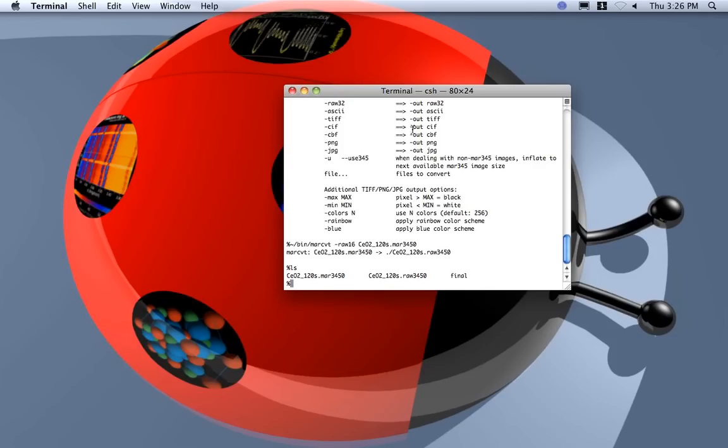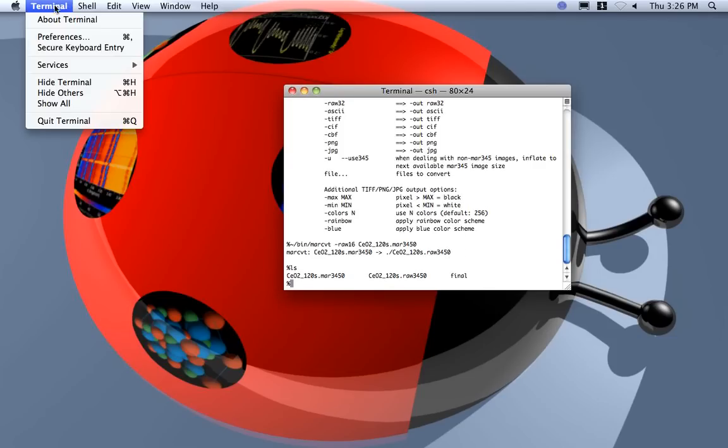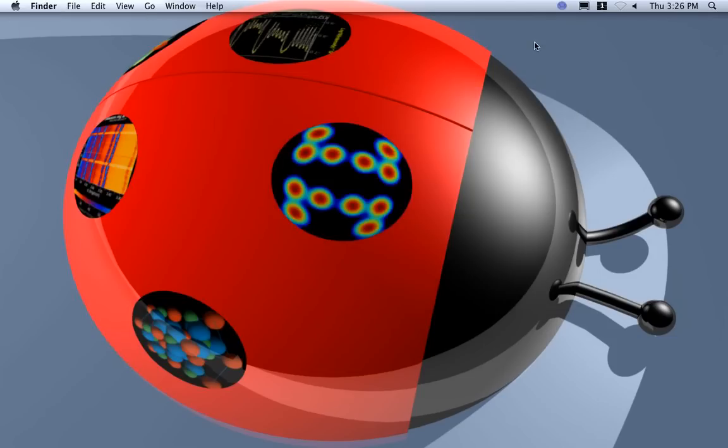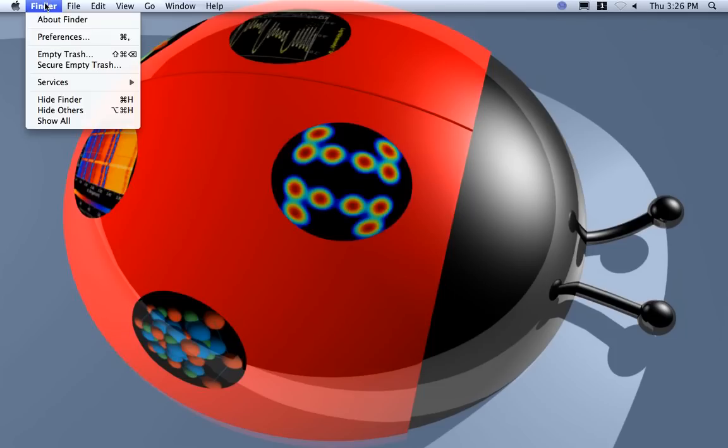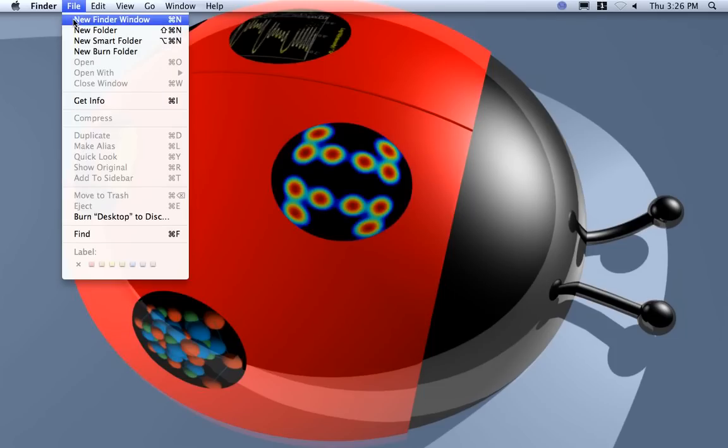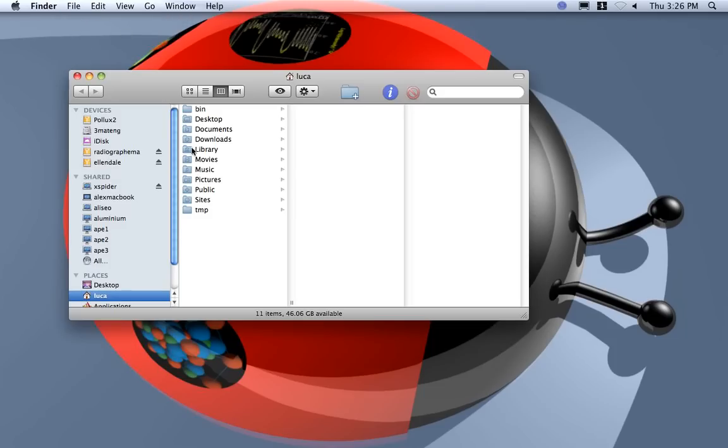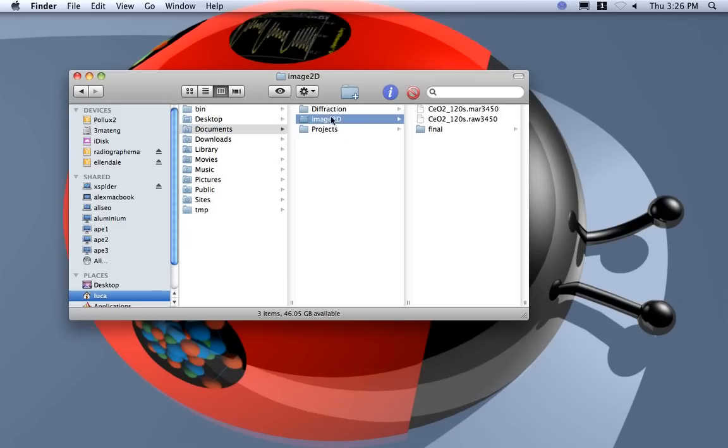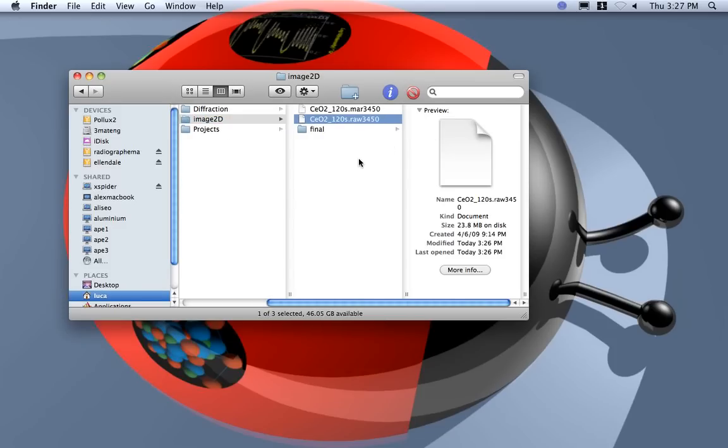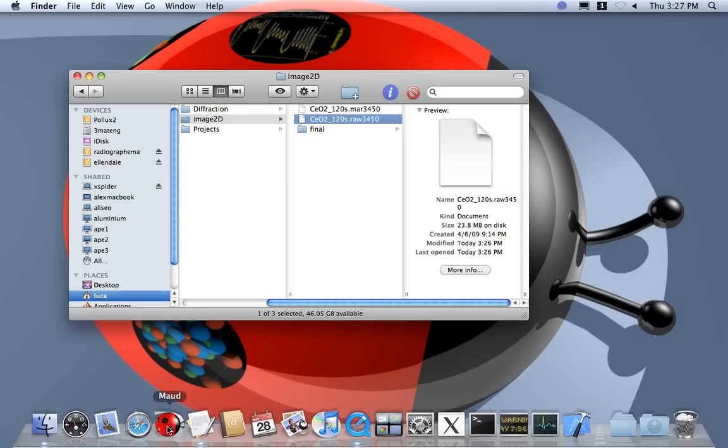Okay, now I can exit from the terminal and I get there. So I put everything inside here, so I have the raw image now. I start MAUD.